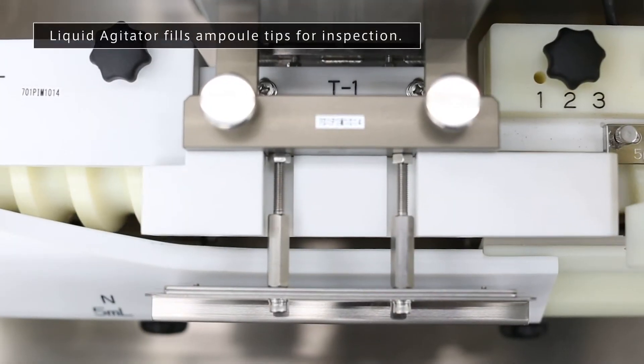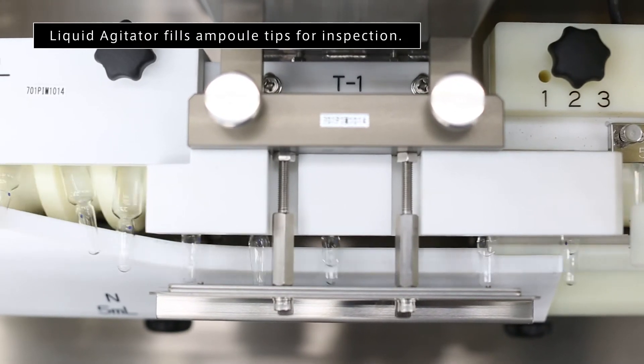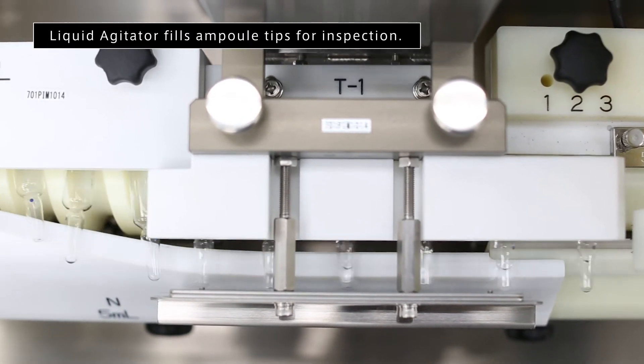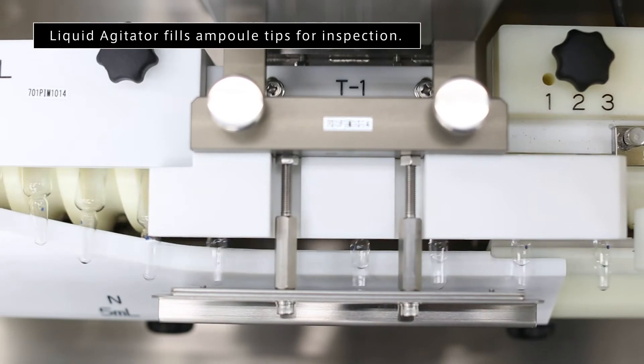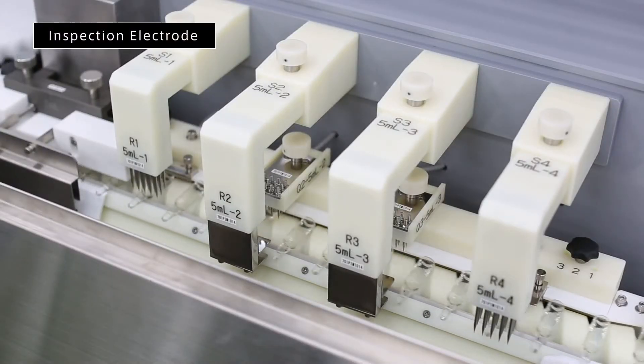The machine ensures there is sufficient liquid in the tip for inspection by gently agitating the product. Multiple inspection stations are used to cover the full surface area of the container.